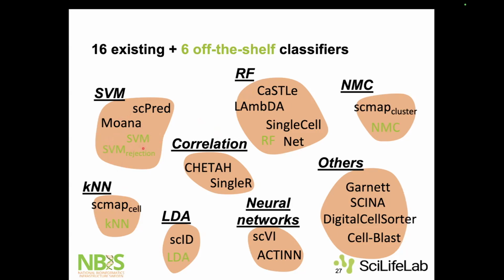They wanted to see if a general classifier coming from scikit-learn, without knowing anything about single cell data, can generalize when we use different reference data. So they compared how much the other classifiers are tuned for certain data types or situations. They used k-nearest neighbor and SVM, and also added an SVM with rejection functionality.